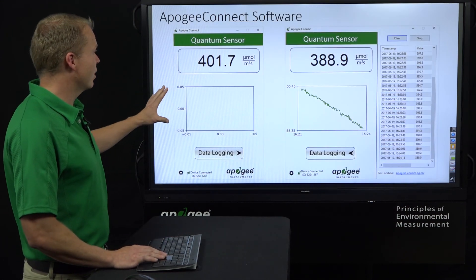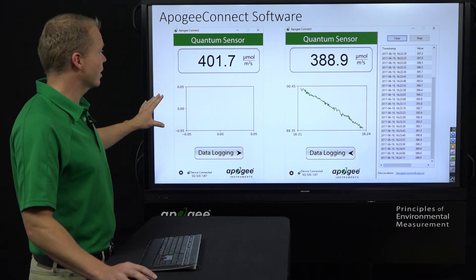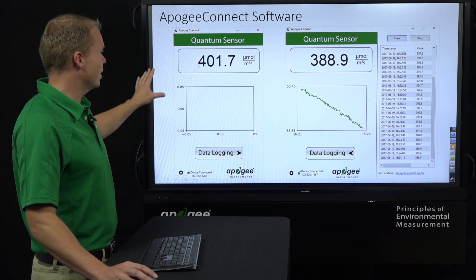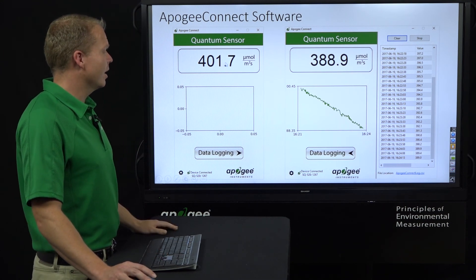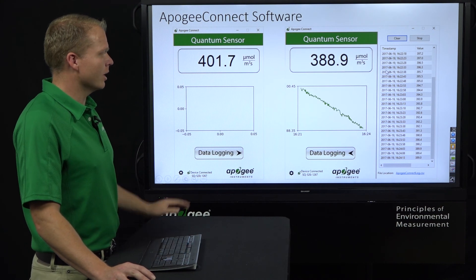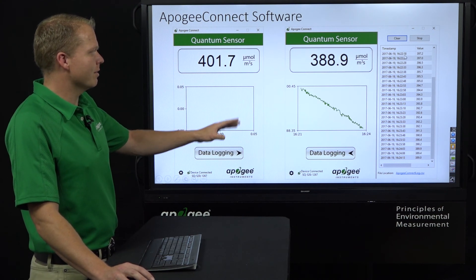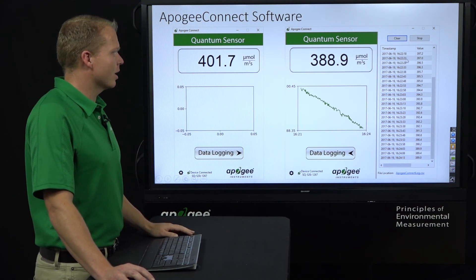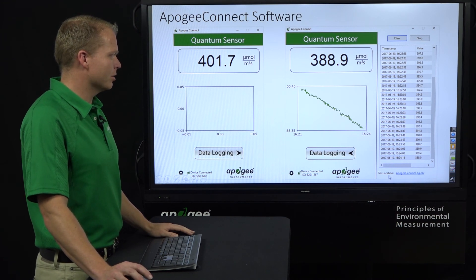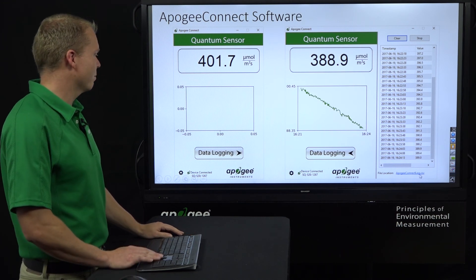This is an example of what the Apogee Connect software looks like. You can see the instantaneous reading, and here we're logging directly on the computer at five-second increments, with the data being saved to a CSV file.